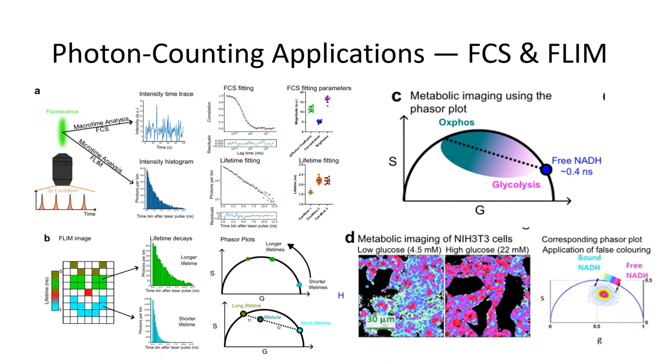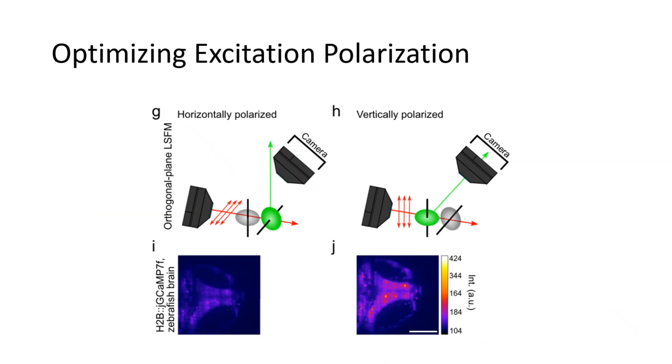Fluorescence lifetime imaging collects decay profiles and maps free versus protein-bound NADH, giving a label-free readout of cellular metabolism up to 700 micrometers deep. Combining both techniques on one microscope lets us measure in the same cell how molecules move and how much ATP the cell is burning. Signal is useless if the specimen dies.